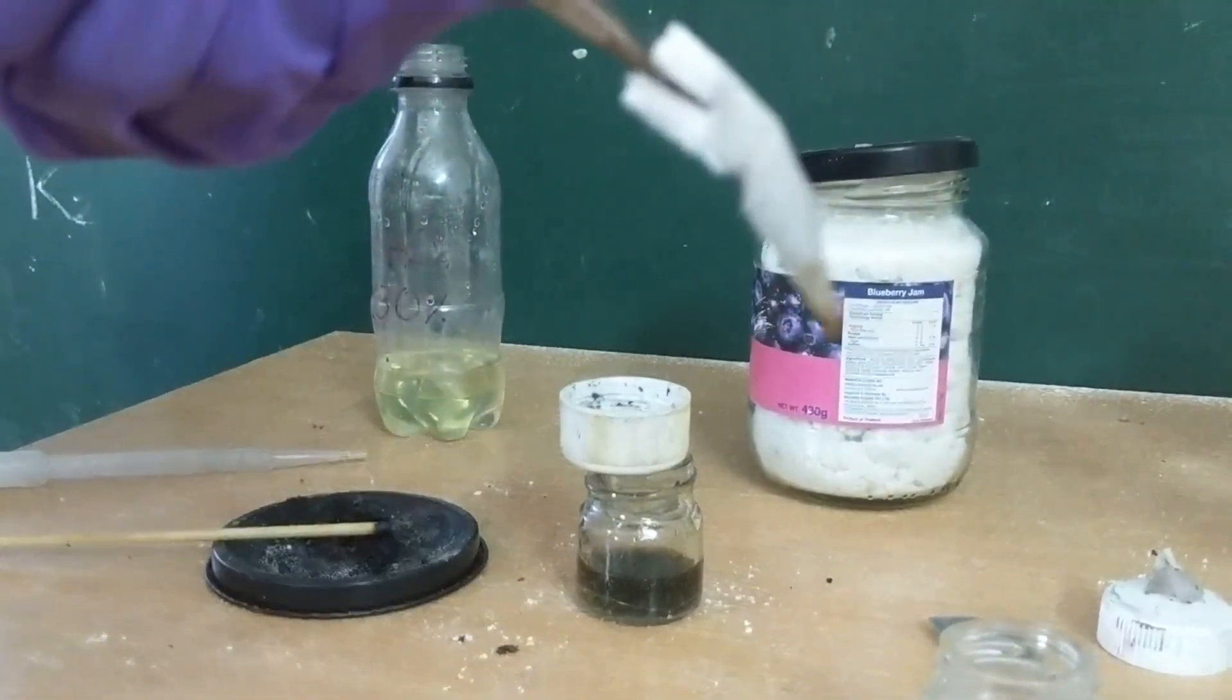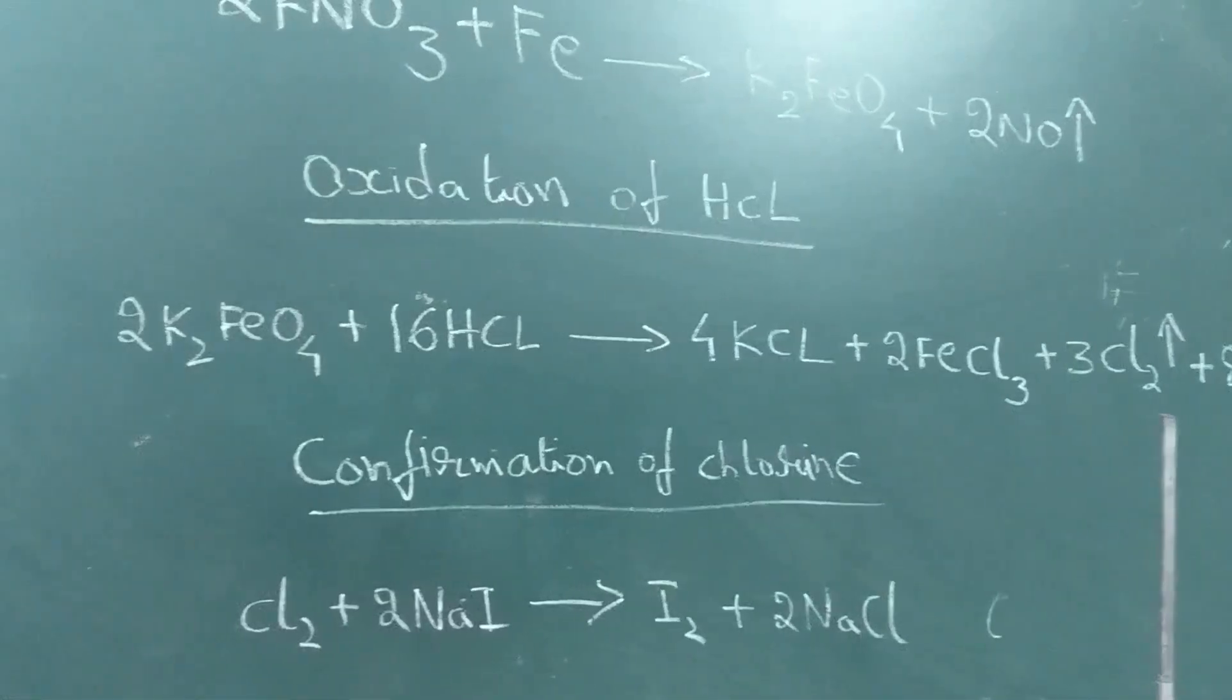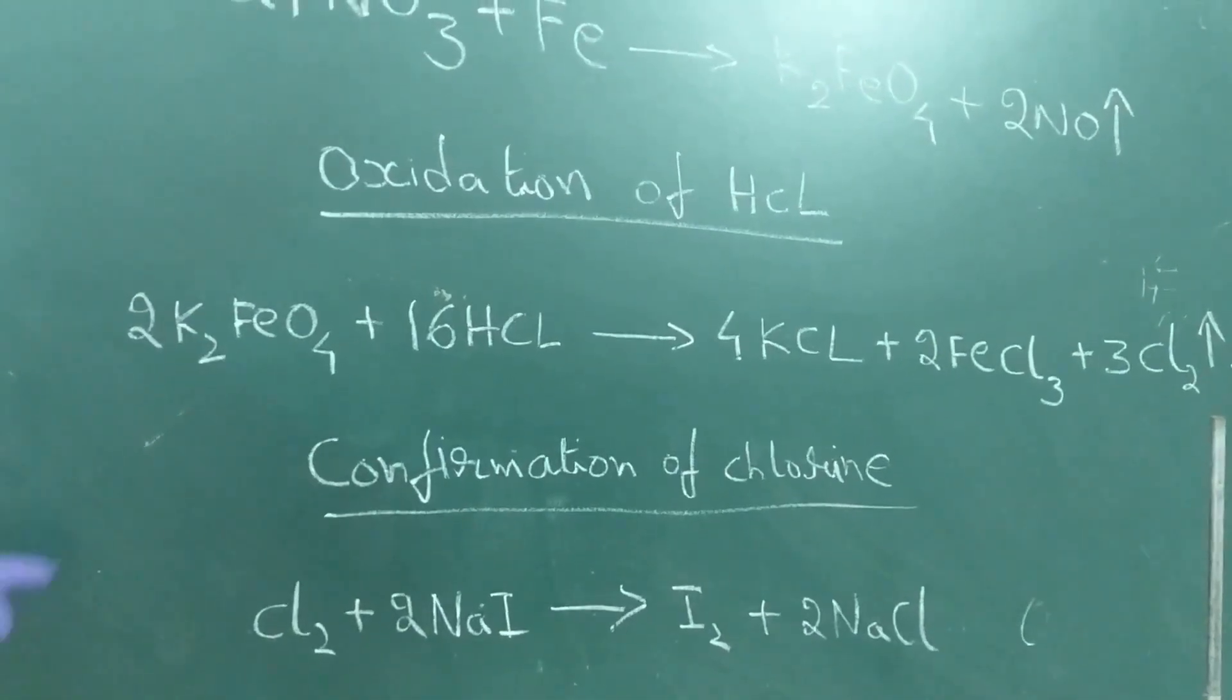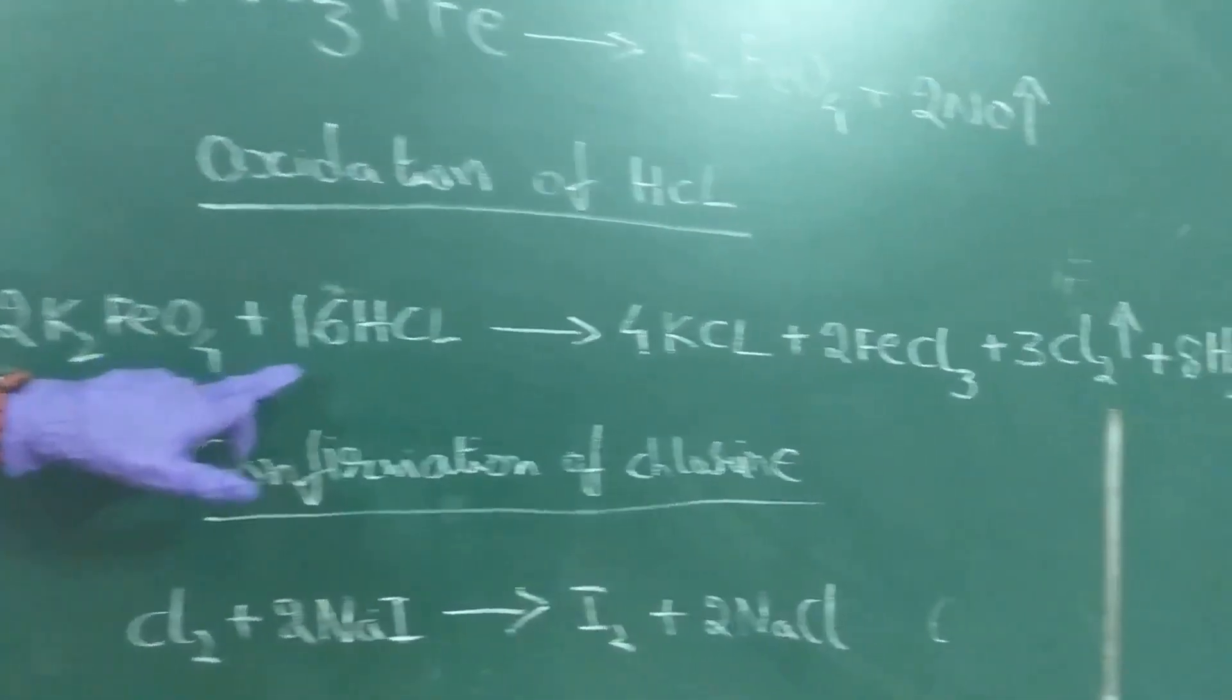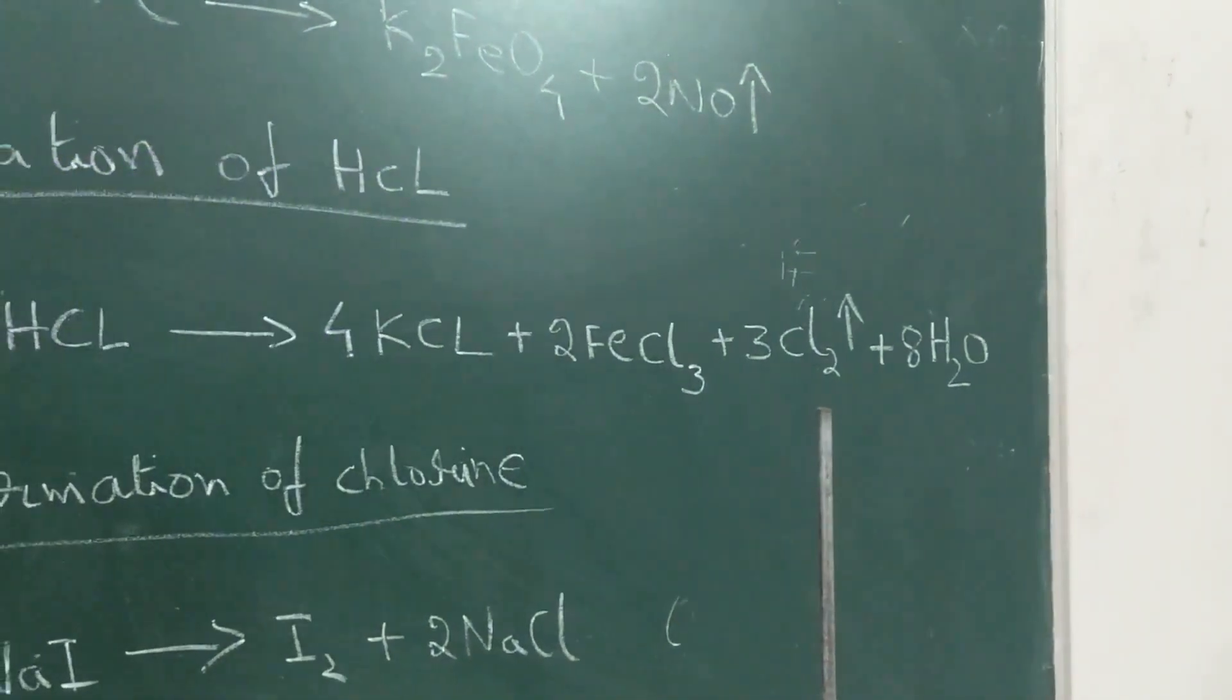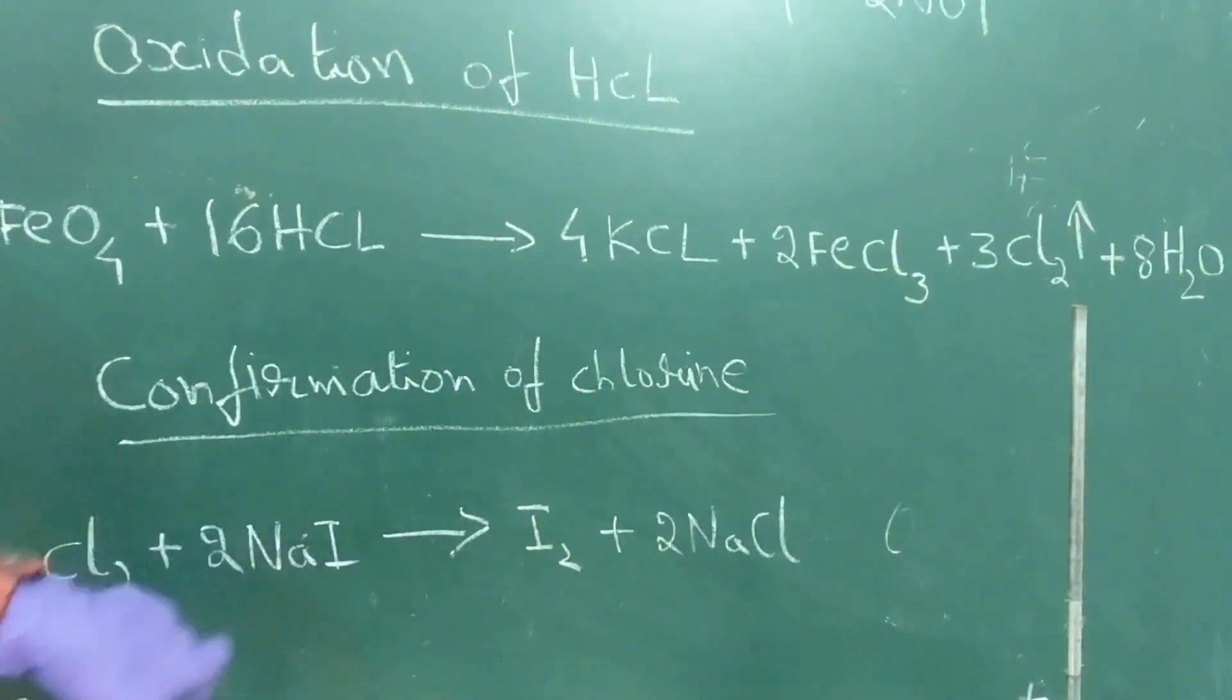As you can see, the tip of the paper has turned brown due to the liberated iodine. This proves the presence of ferrate in the given product. This is the oxidation of hydrochloric acid by potassium ferrate. It reacts with hydrochloric acid forming potassium chloride, ferric chloride, chlorine, and water. The chlorine is confirmed using sodium iodide solution, and there's a single displacement reaction wherein iodine is liberated, which turns the paper brown.